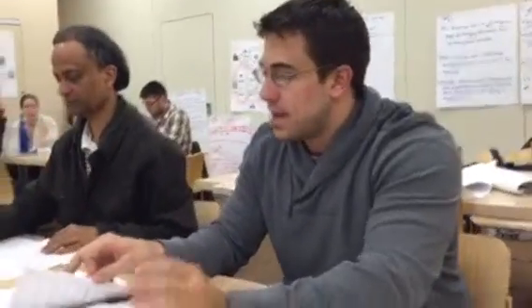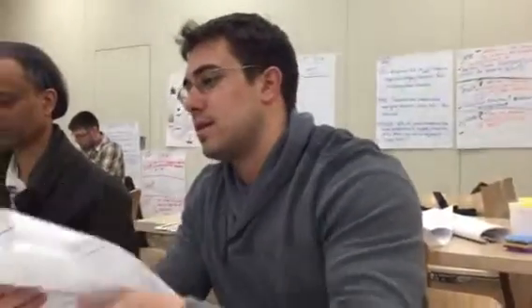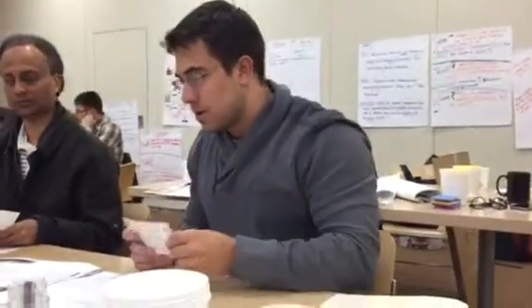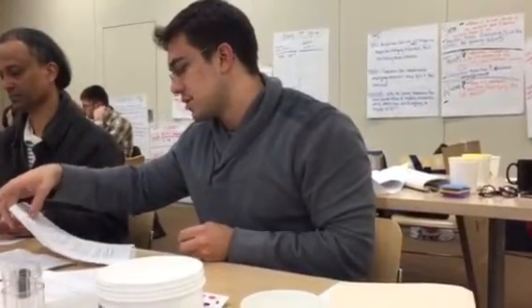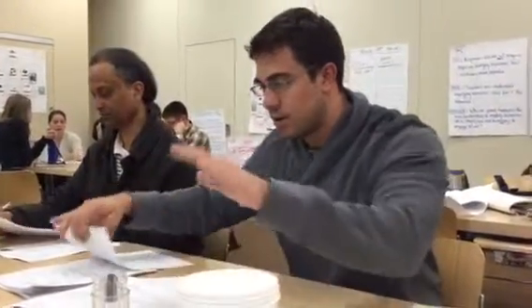Two handouts that you guys have. One of them says river ecology variables, and on the back is a photocopy of what would come in this little bucket. So you're all going to get one of them. It gives a little background on DO and some of the other tests that can be done here. It also talks about which factors can be measured in this, so some of the abiotic factors that this will measure.